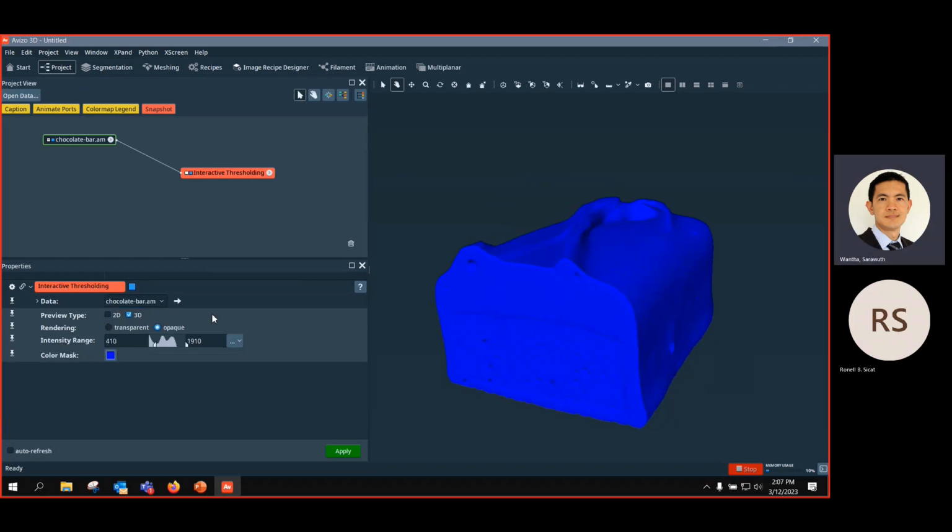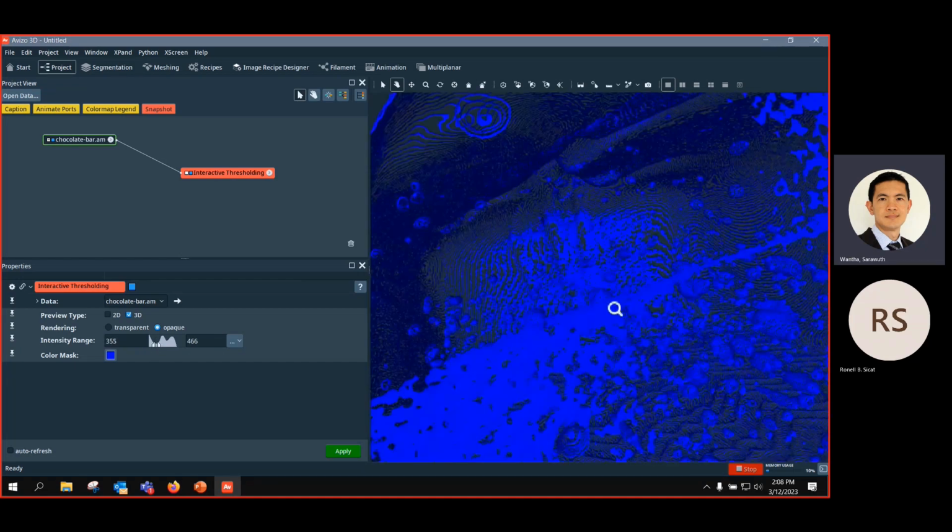Yeah, so for example, if I want to threshold in 3D the porosity only, like this, you will have to do a few steps like thresholding, and you can see the effect of my graphic card working maybe too much and starting to not display properly.